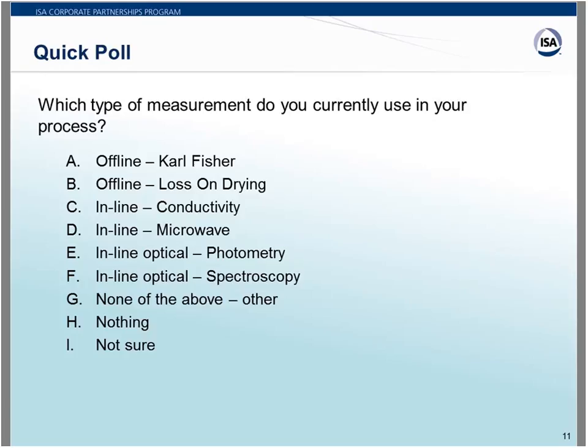If you have a laboratory that's doing Karl Fischer, an inline doing photometry, and an inline FTNIR or laser spectrometer doing spectroscopy, fill this out. If we bring up something during the rest of the talk that you have out there in the plant, just fill it in. We will check these at the end and discuss them.